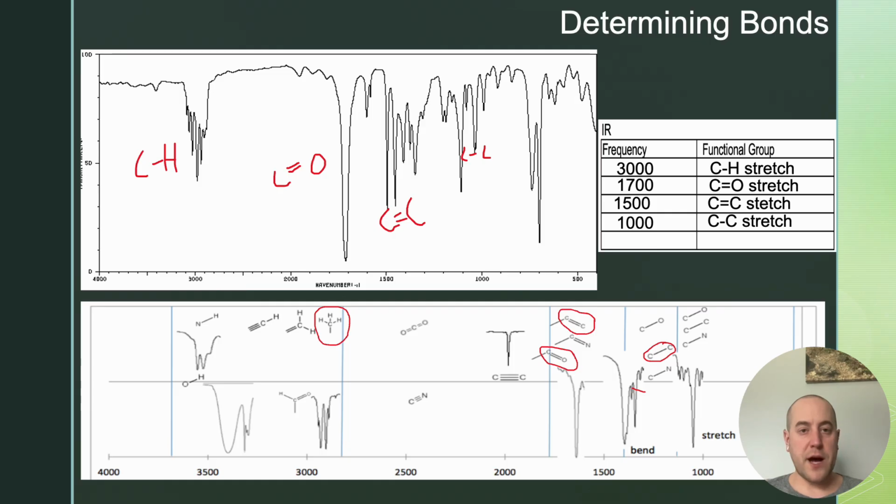To determine what bonds are present, we are given this IR spectroscopy graph here for our compound. Below I added the key to show which peaks represent which types of bonds. So starting with our graph, furthest downfield is considered to the left with the higher numbers and upfield to the right with the lower numbers.